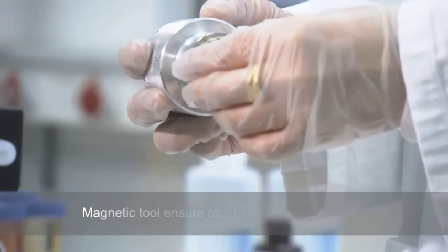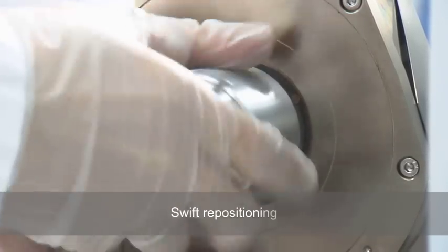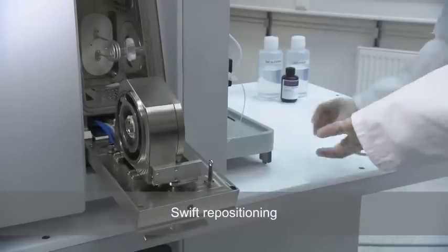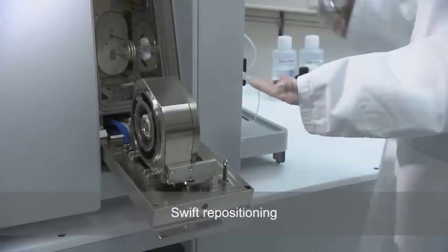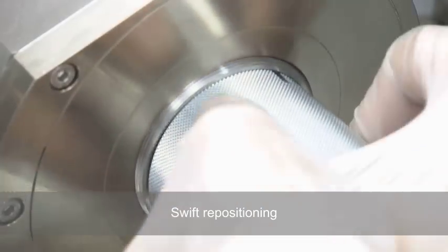The simplicity of the magnetic tool ensures rapid and reliable mounting of the cones. The skimmer cone is swiftly repositioned, and the sample cone and mounting ring are efficiently remounted together.